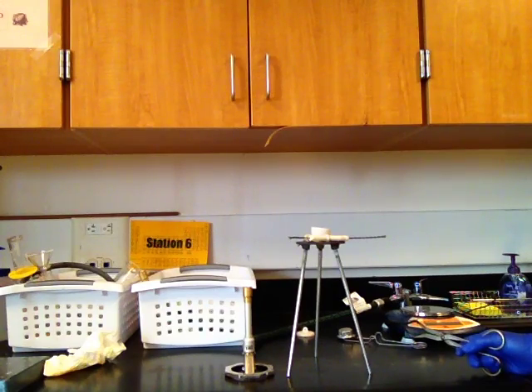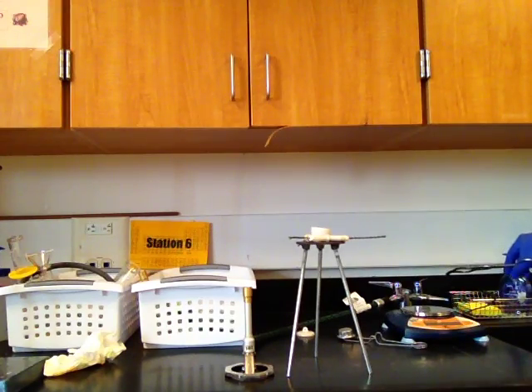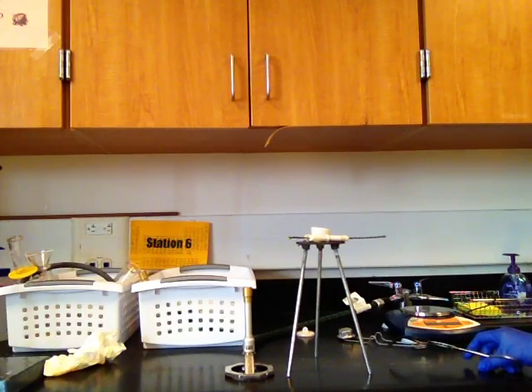Second thing, make sure your crucible has cooled enough. Why is the cooling part important? Because if you put a hot crucible on the weighing scale, it can heat up the air around the scale and create an upward thrust, so the mass of the crucible comes out to be less than the actual mass. That will be an error. So make sure that your crucible is cool before you take the mass.